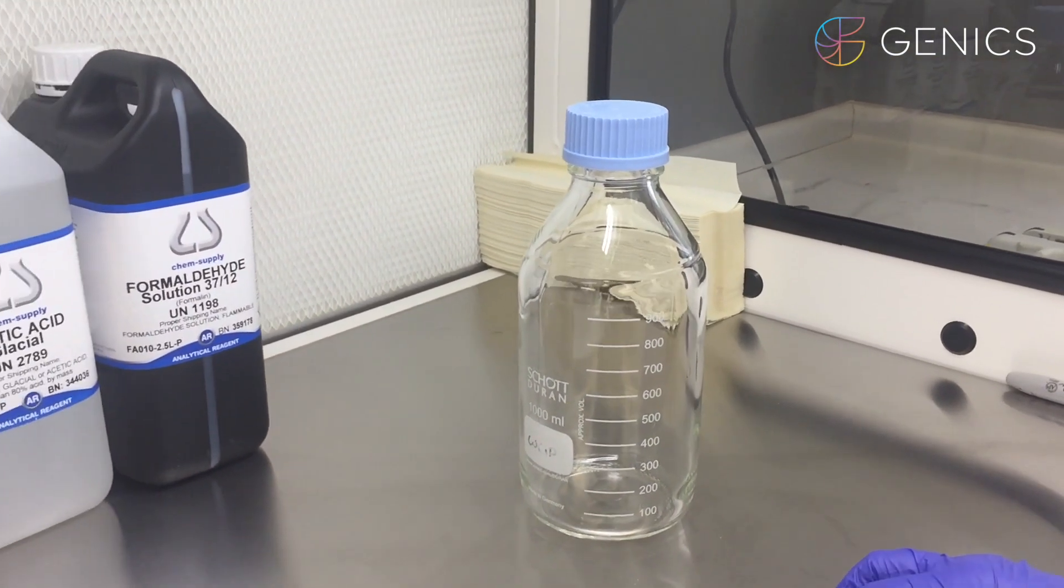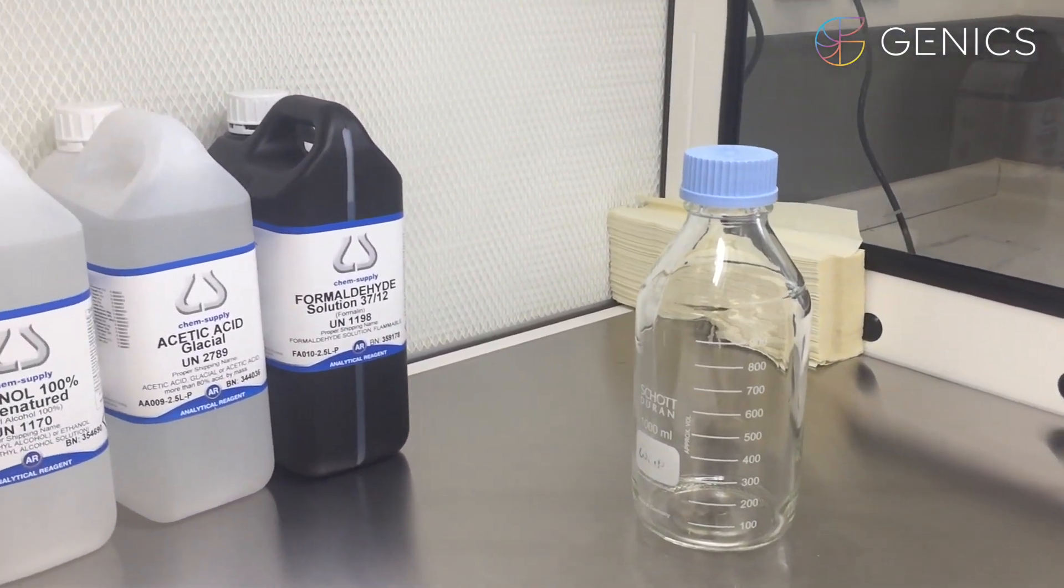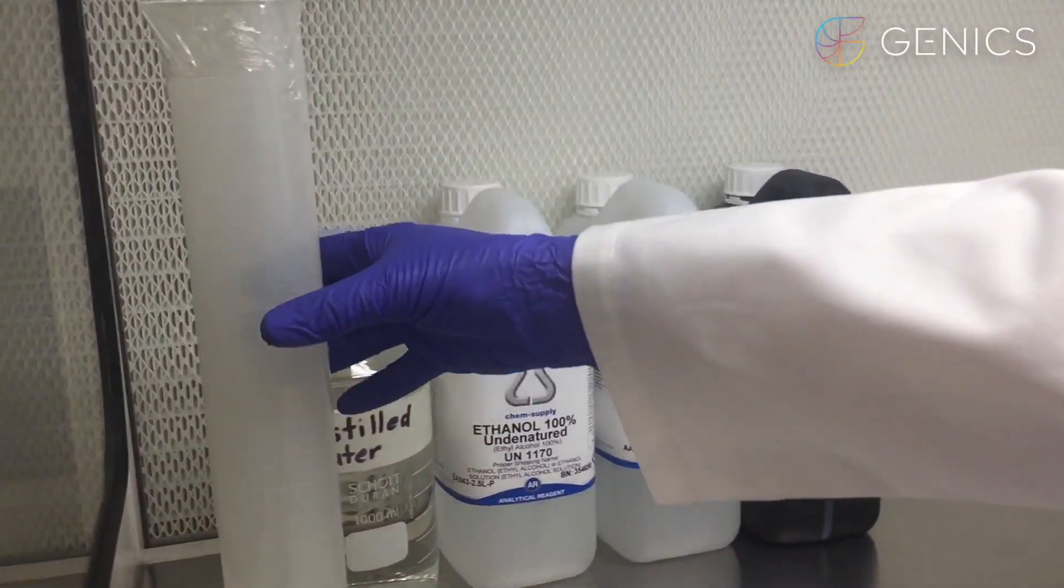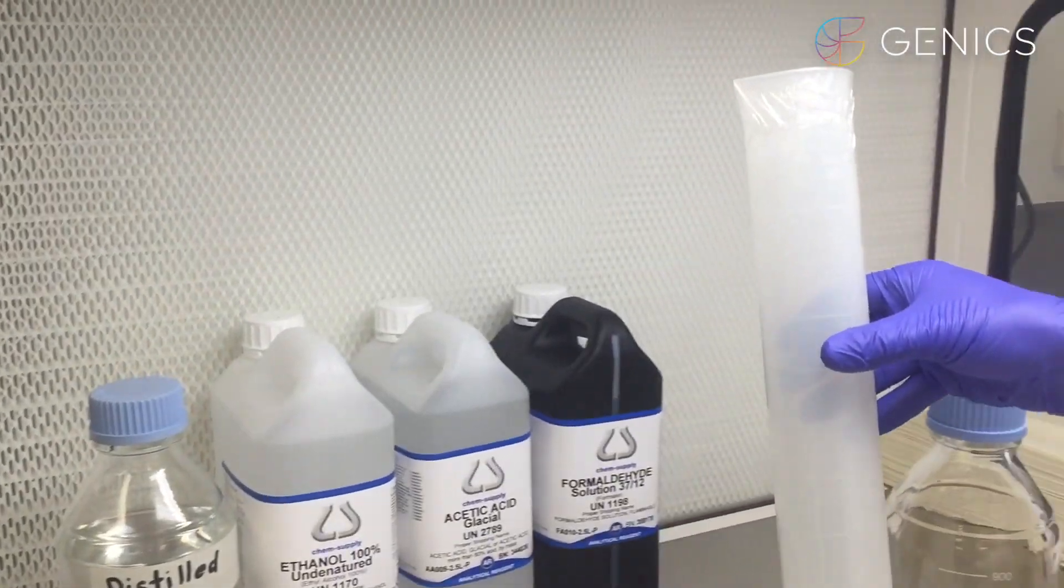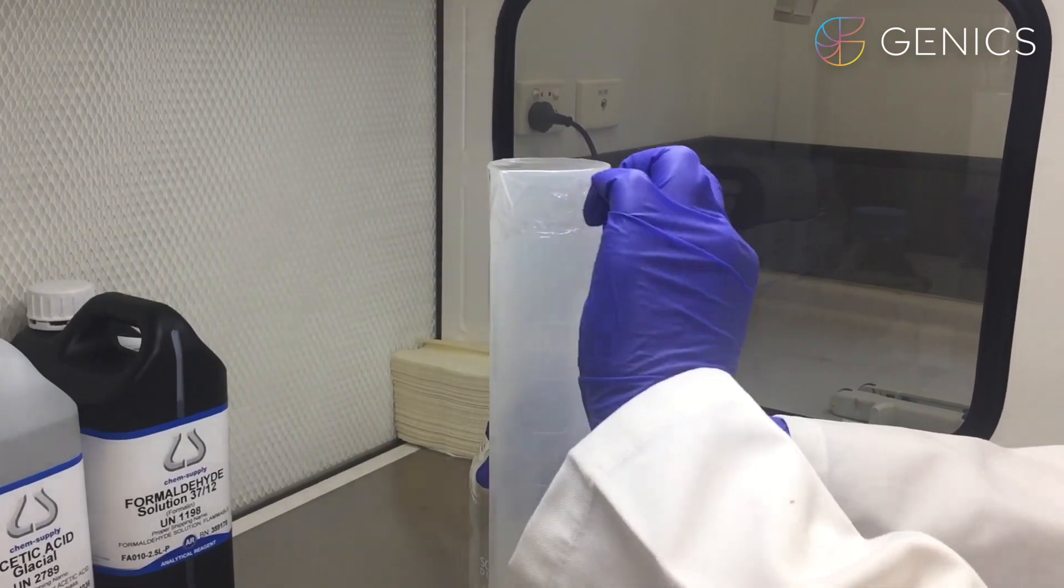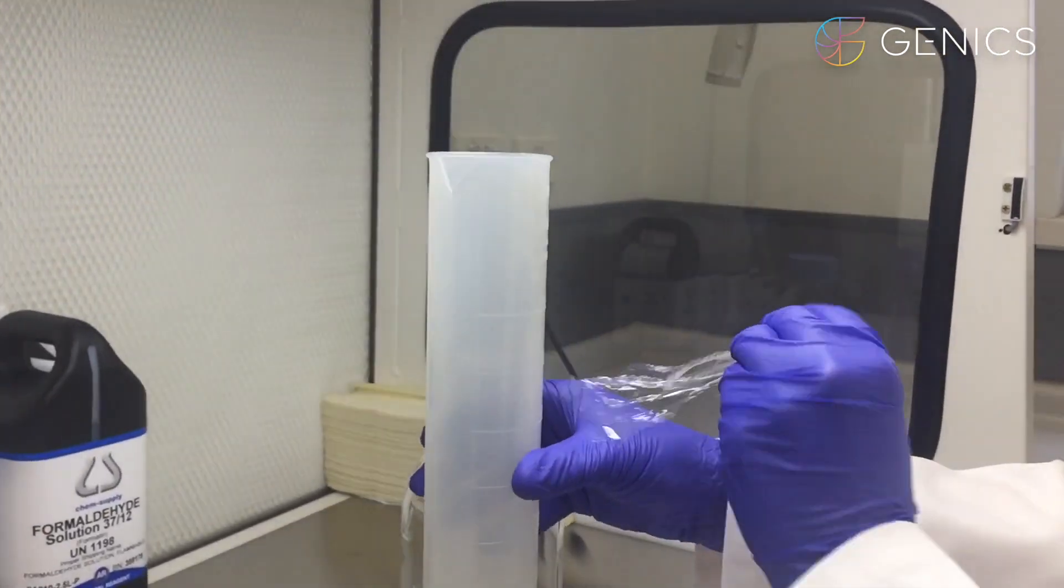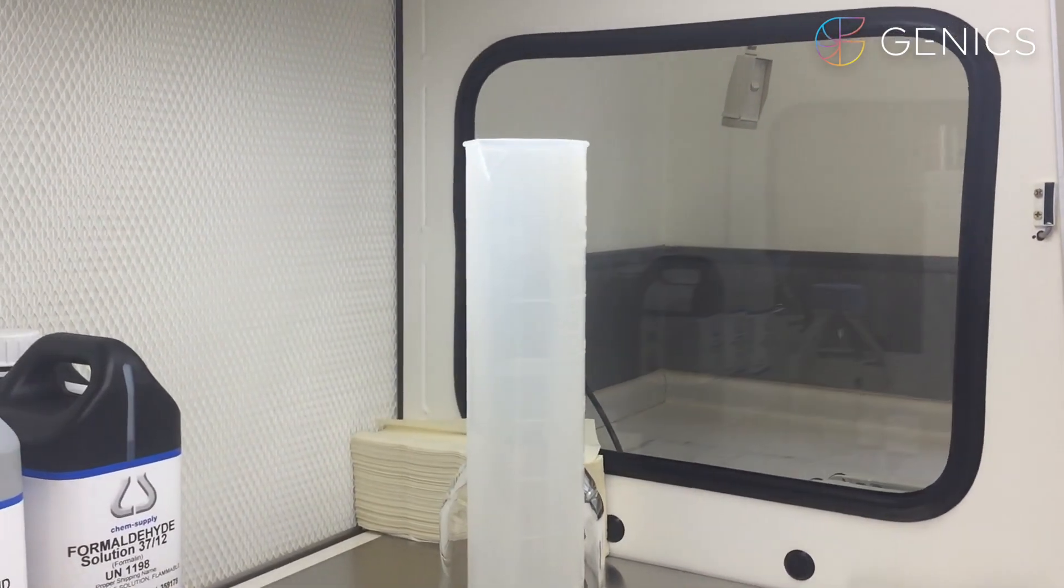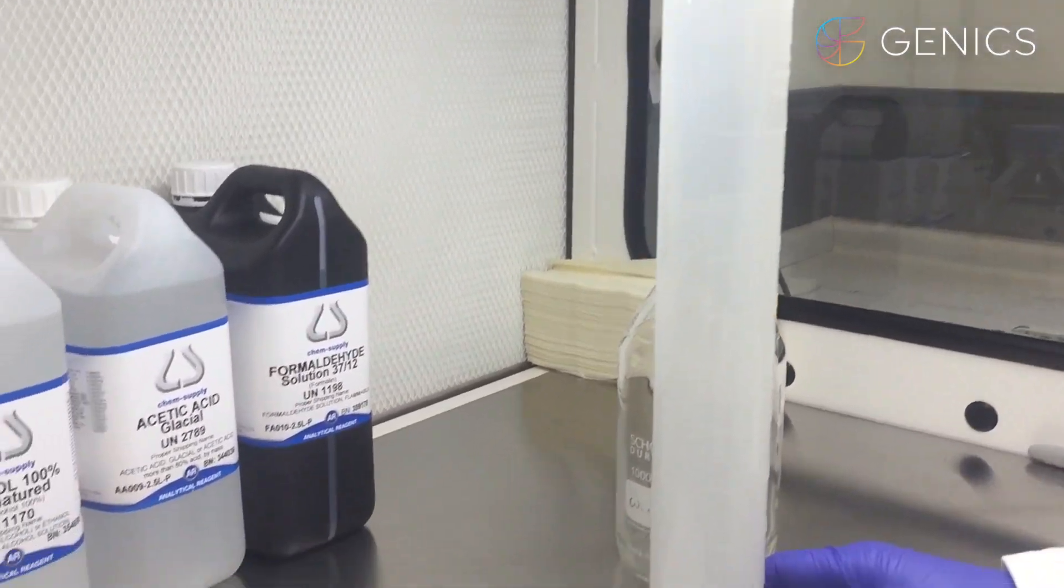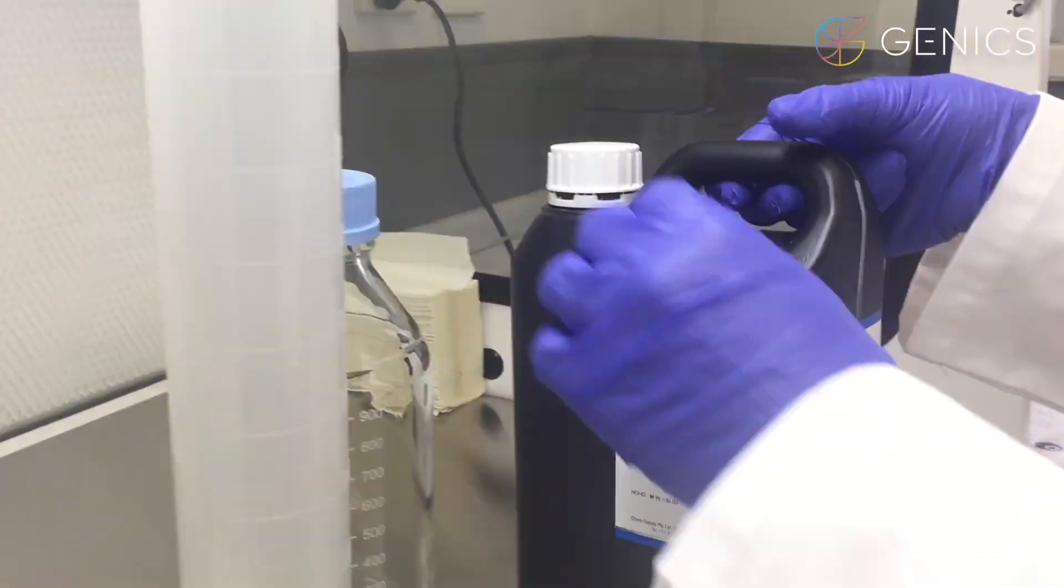So our first ingredient is 220 mils or milliliters of formalin. I have a measuring cylinder here to measure out the different chemicals. 220 mils of formaldehyde or formalin solution.